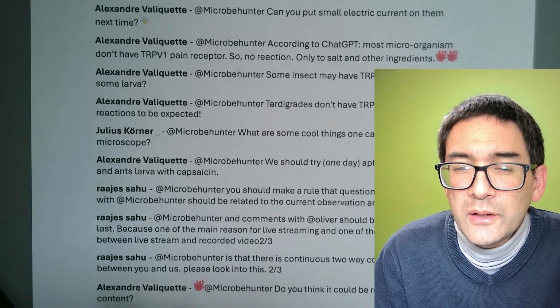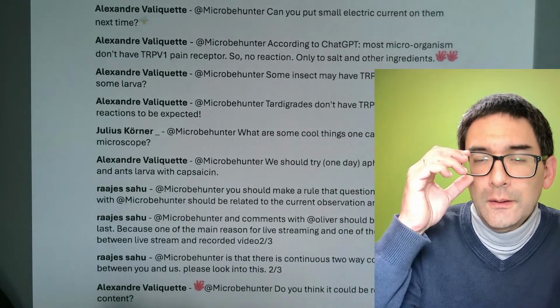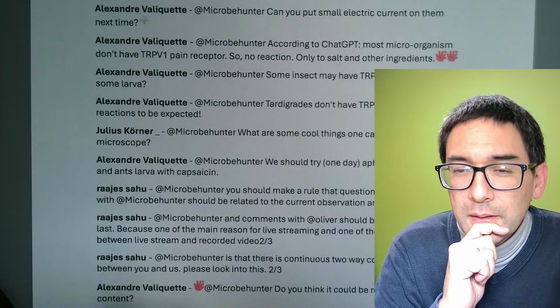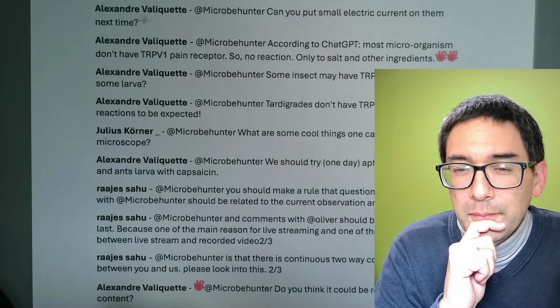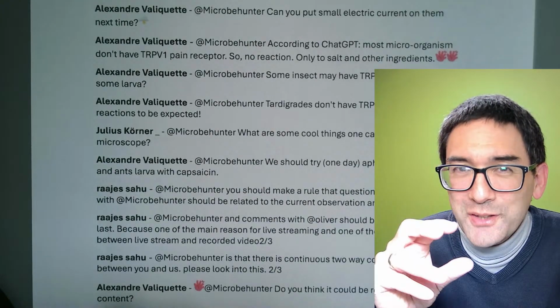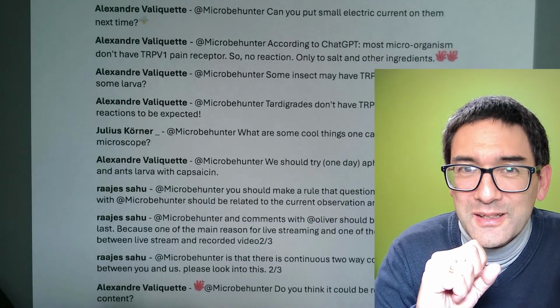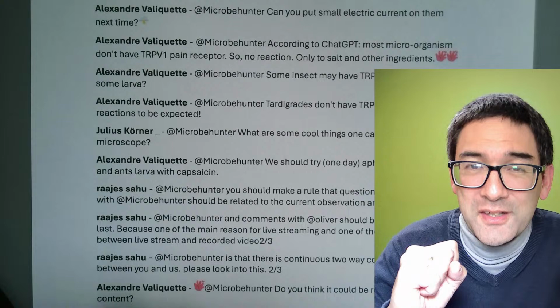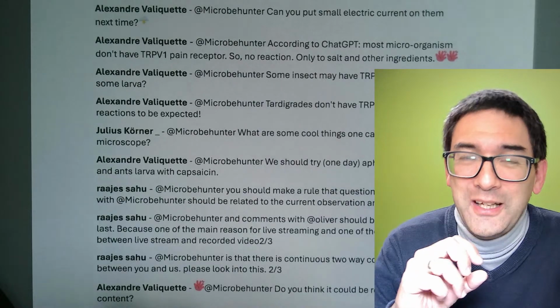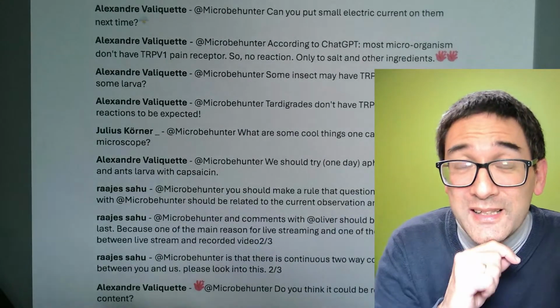What was the most interesting or uncommon thing you observed under the microscope? That's a good one. Difficult, because there are so many things that keep on reappearing. I'll think about that. Generally, what I found sometimes impressive is if certain microorganisms start to hunt other microorganisms. I've actually seen certain ciliates that were swallowing up other cells, which were sometimes even larger than themselves. And I've seen once a flatworm going around really hunting and chasing down other organisms. That's actually a nice one.